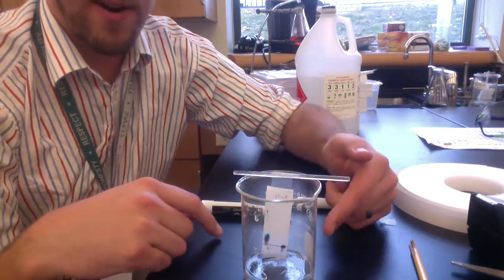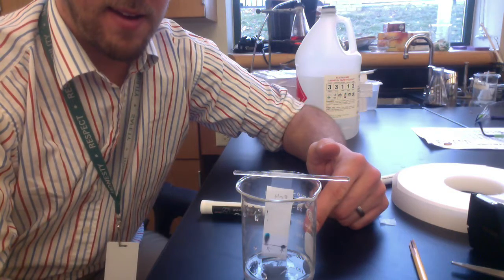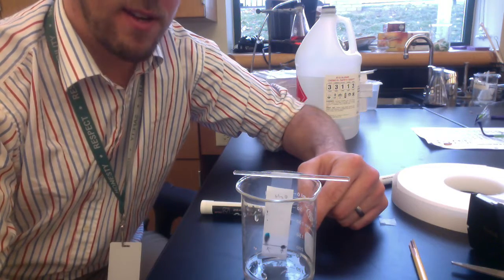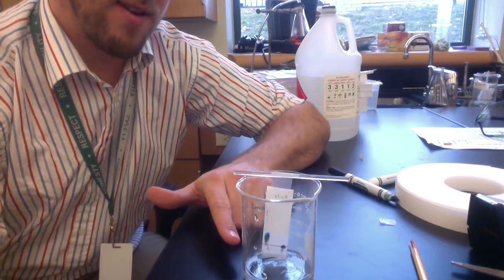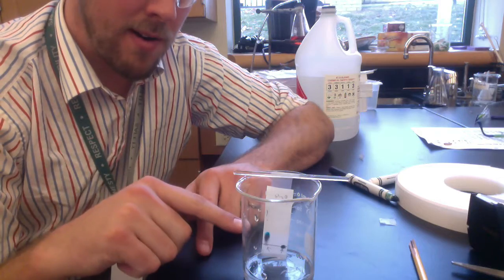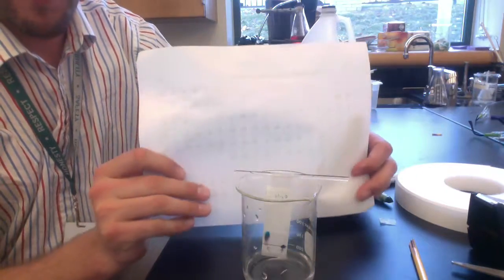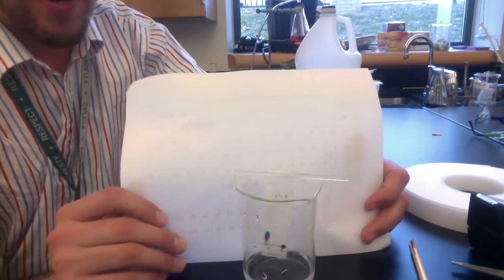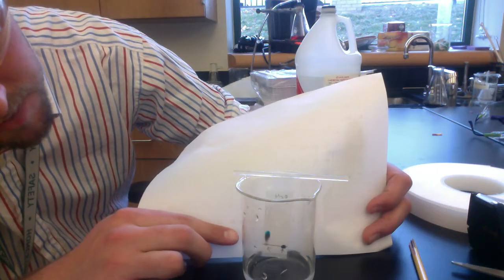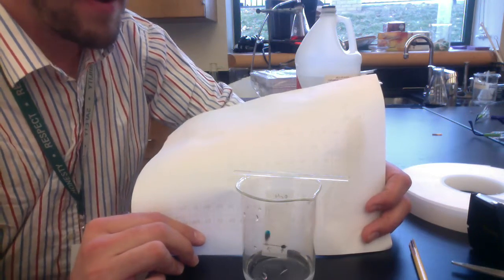So right now, the dry erase marker over here hasn't moved at all. It's got an Rf value of 0, and it tells you that dry erase is really not soluble. It's really not able to be dissolved in water, whereas over here, you can see that maybe that blue ink on the top is traveling with the top of the water line. I don't know how much of that water line you can see. Maybe if I put a piece of paper behind it, you can see it a little easier. Maybe not. The blue is traveling with the top of it, so it's got a high Rf value, probably of 1, whereas down towards the bottom, maybe purple or yellowish colors are not traveling very much with the water, so they have a lower Rf value.